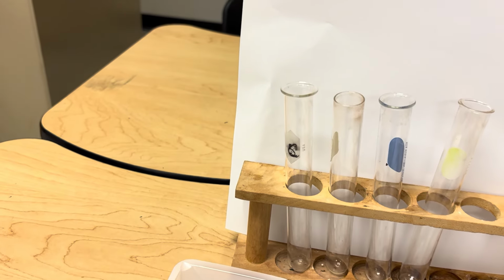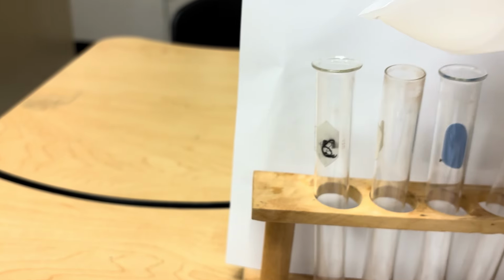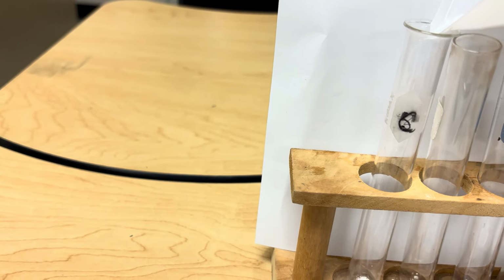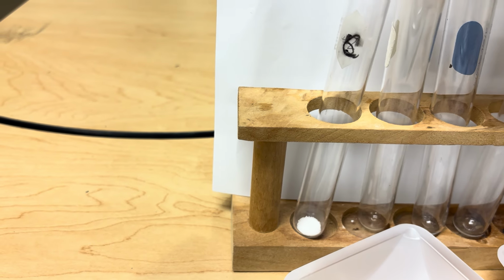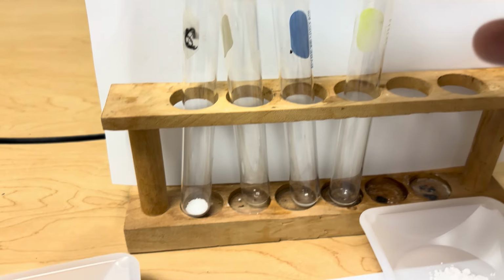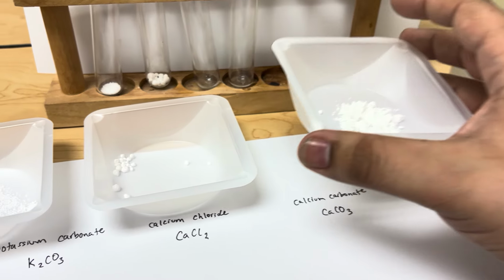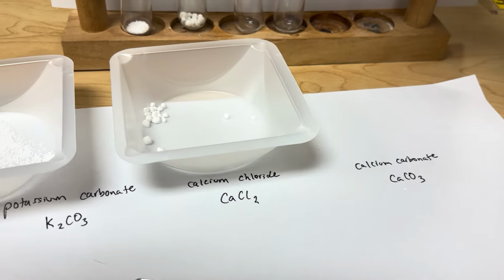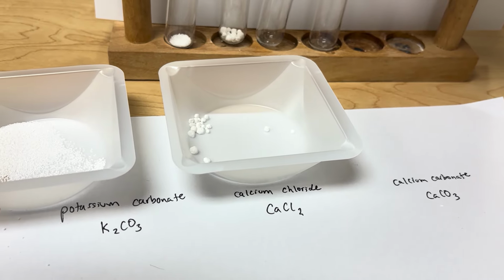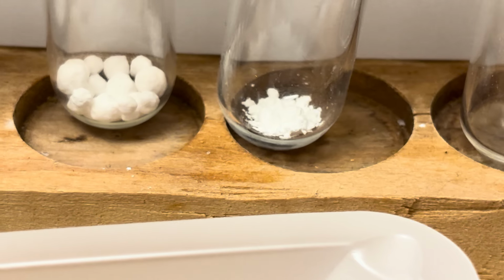All right, so here is my potassium carbonate. Oh my, how am I going to do this? Here's my potassium carbonate. I'll just pour it in, I guess. That's good. I don't need all of it. And now I'll do my calcium chloride in my second test tube. That was maybe more than I wanted to. And then my calcium carbonate in my third test tube. And this one I really don't want a lot at all. I'll just do that tiny little amount right there.